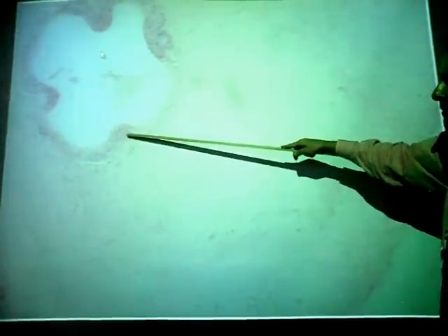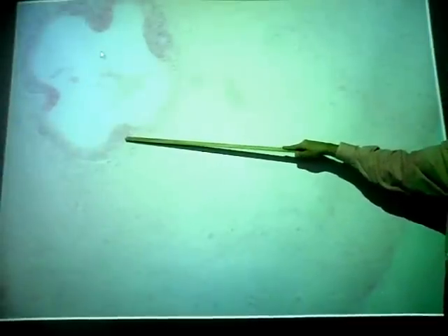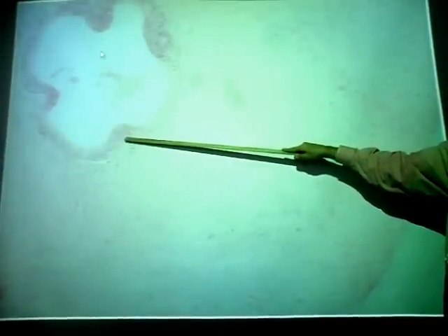Okay. So again, epithelium, which is what? Pseudostratified columnar, again not ciliated. Here's your lamina propria. First layer of muscle here, longitudinal smooth muscle, middle layer, circular smooth muscle, outer layer, longitudinal smooth muscle. So same arrangement, same tissues that we saw in the epididymis, just a larger version. There's only one tube instead of a bunch of them. Okay? Function is to carry sperm from the epididymis to the urethra.